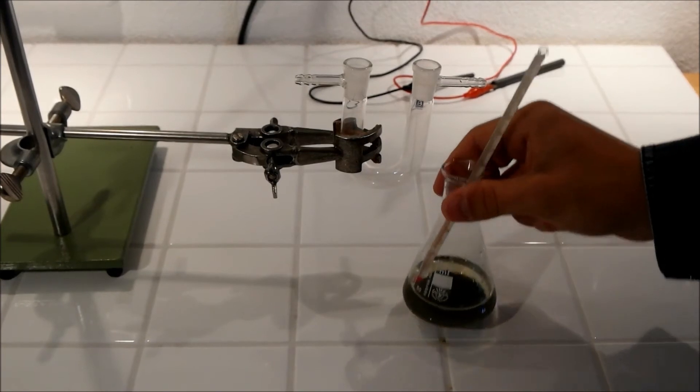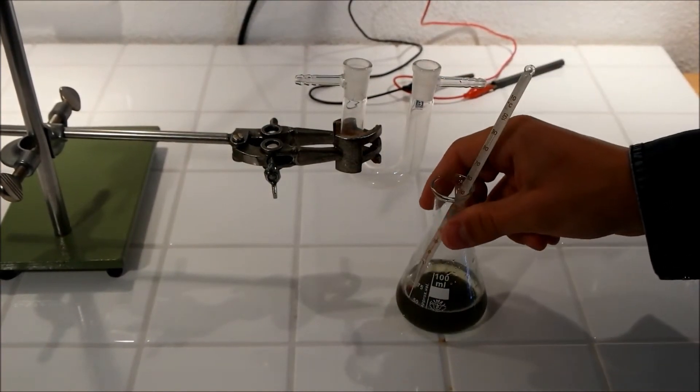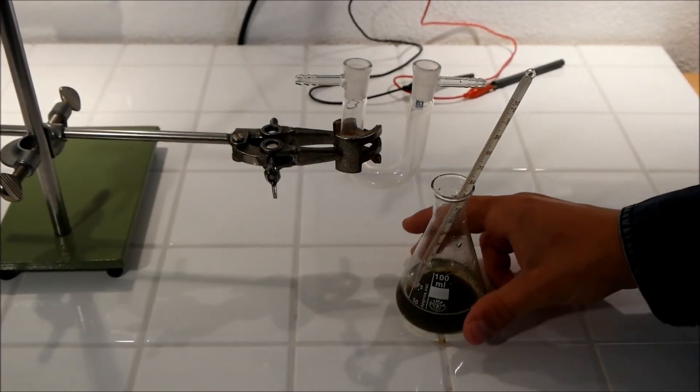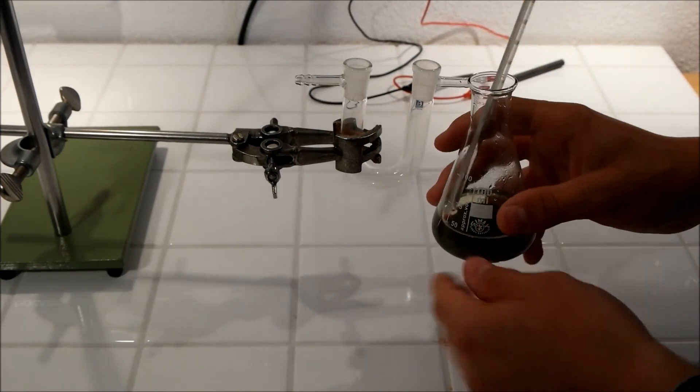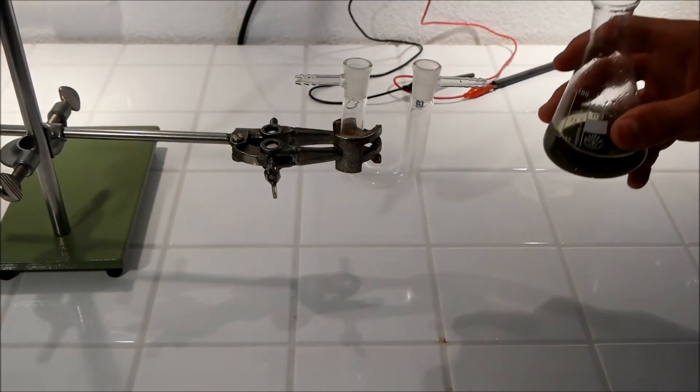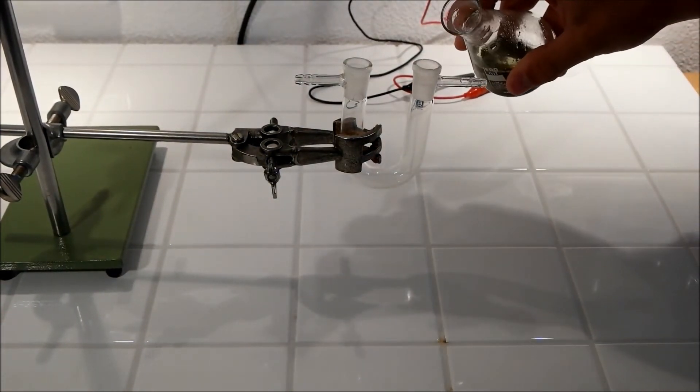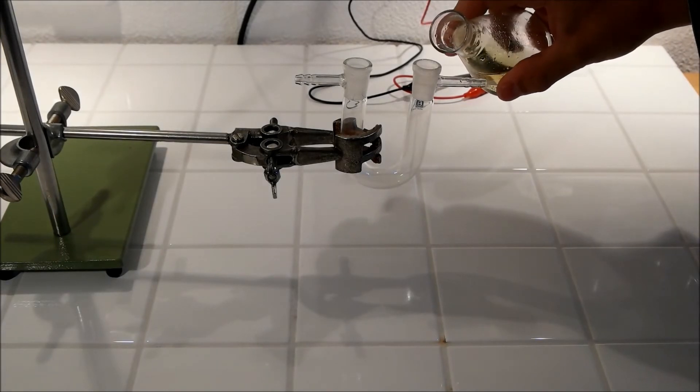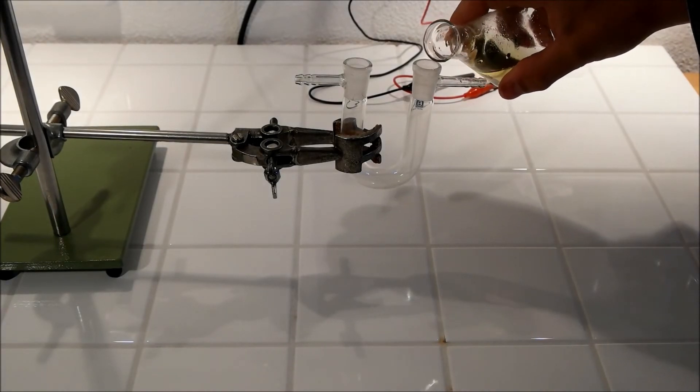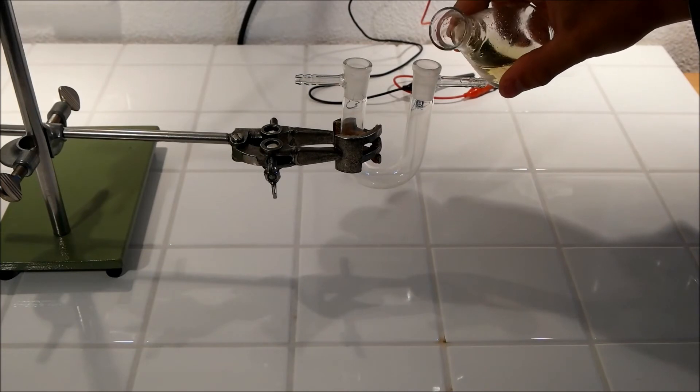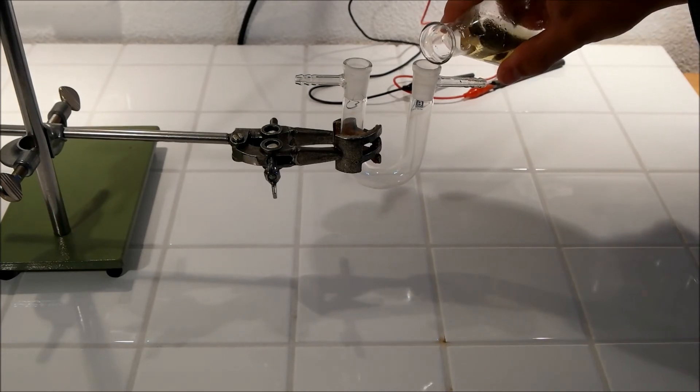If you want, you can filter the solution but I think it's unnecessary. We can keep the zinc powder in the Erlenmeyer flask by just pouring the solution gently into our u-shaped tube. Just wait a bit so that the zinc powder settles to the bottom.